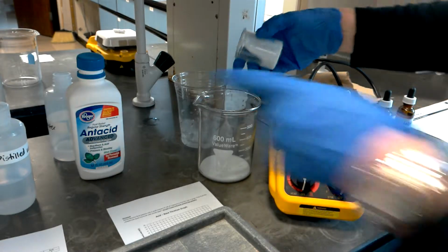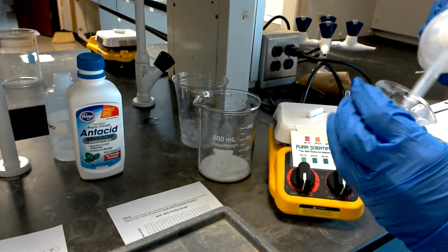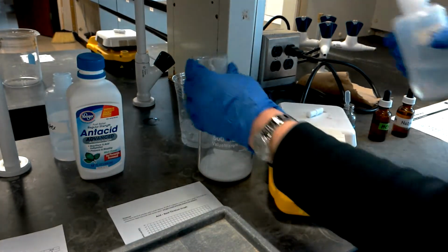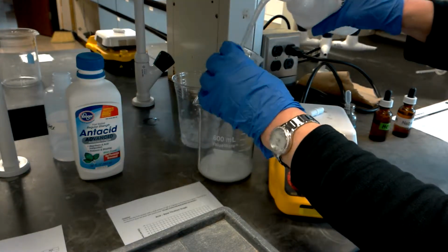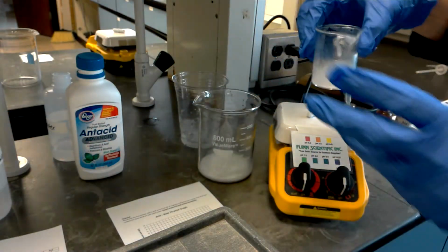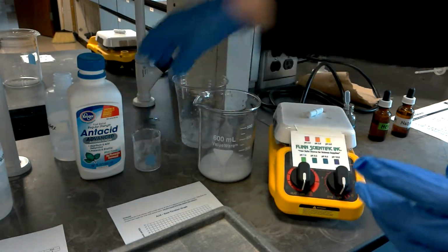The antacid includes both aluminum hydroxide and magnesium hydroxide. And of course, we know that hydroxides are bases. We are rinsing the beaker of as much of the milk of magnesia as reasonably we can get, so that extra distilled water in there won't make a difference.